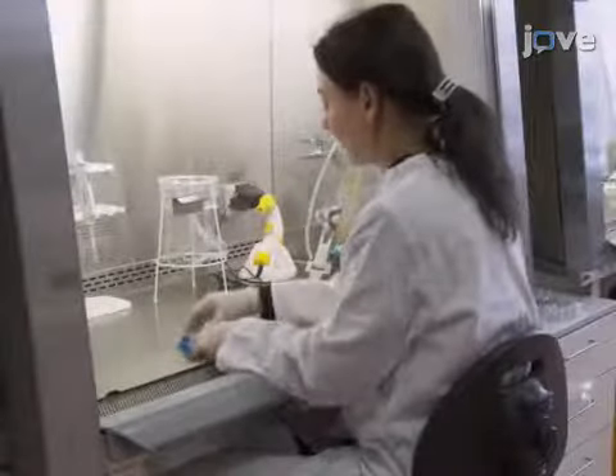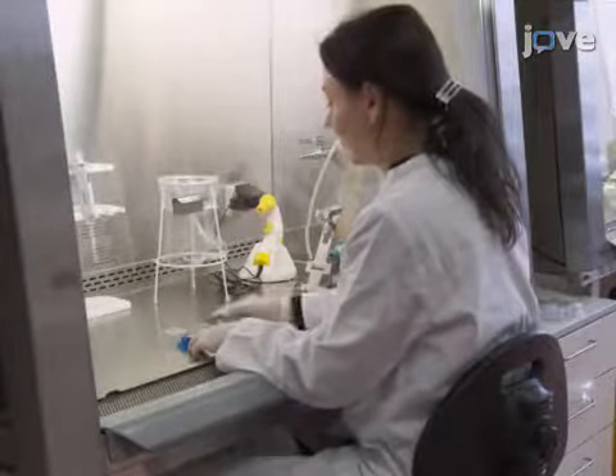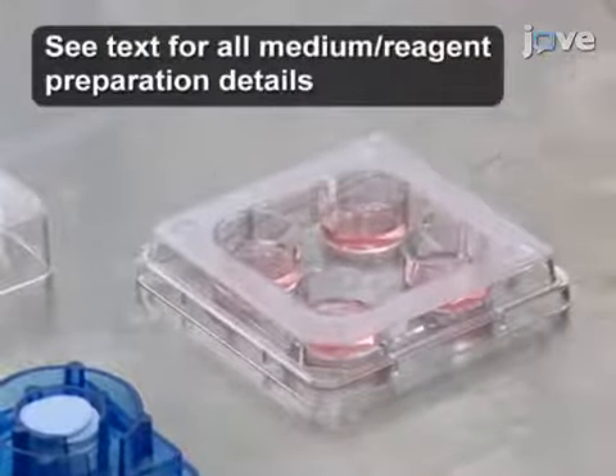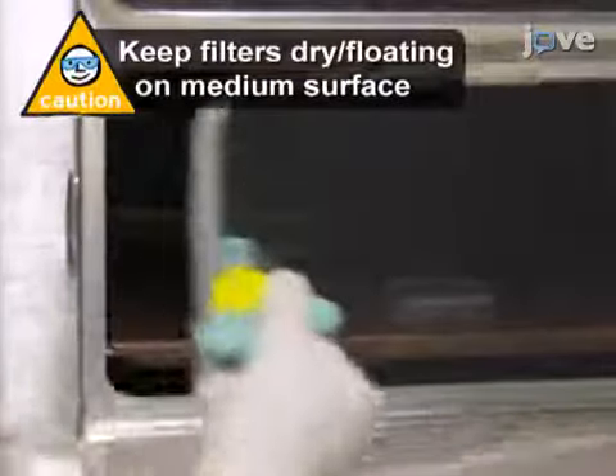Before beginning the dissection, use sterile forceps to carefully place one polycarbonate membrane filter with a 5 micrometer pore size into each well of a 4-well plate containing 500 microliters of fresh culture medium. Transfer the plate into a cell culture incubator.